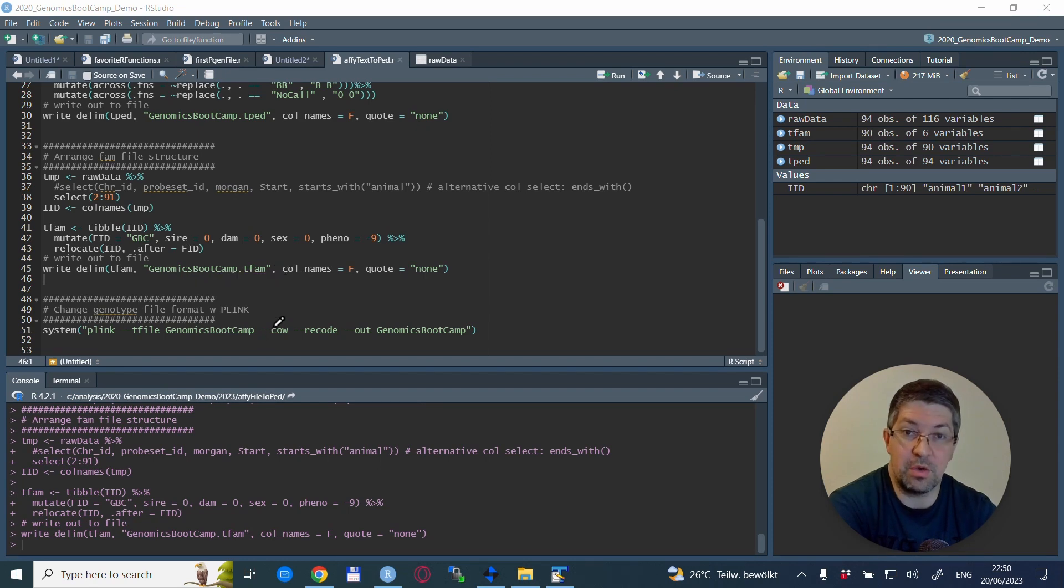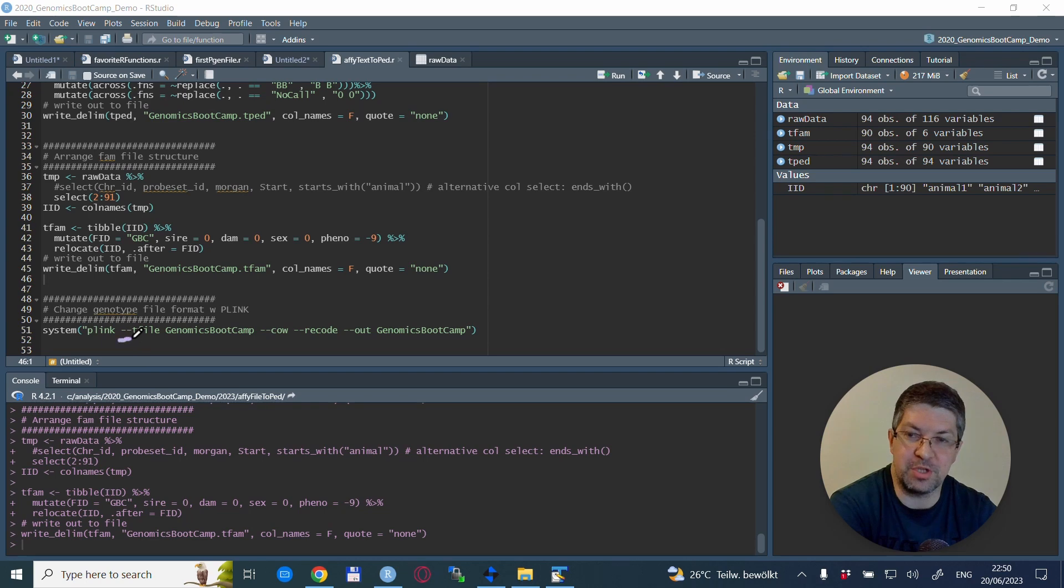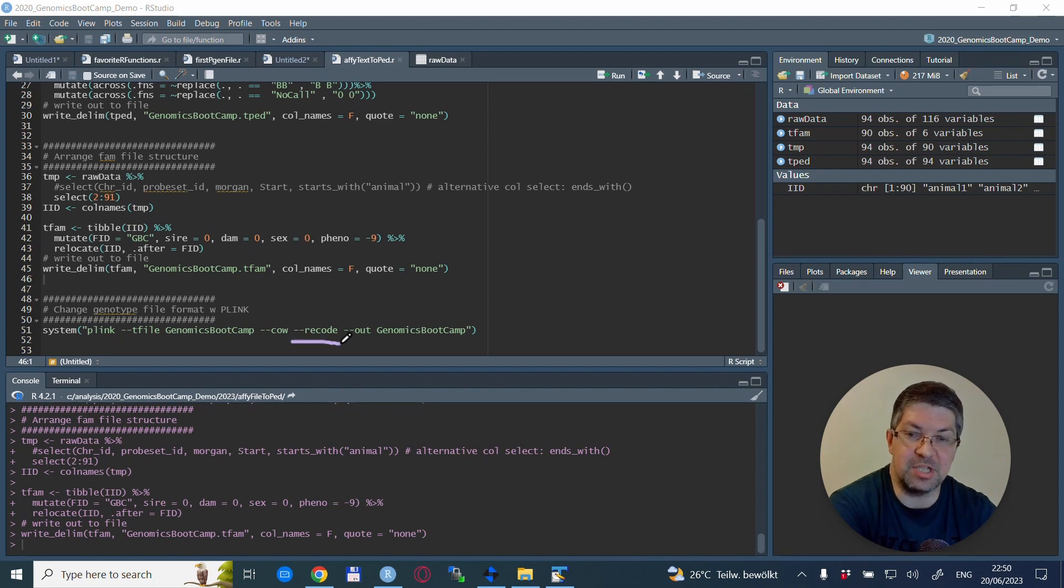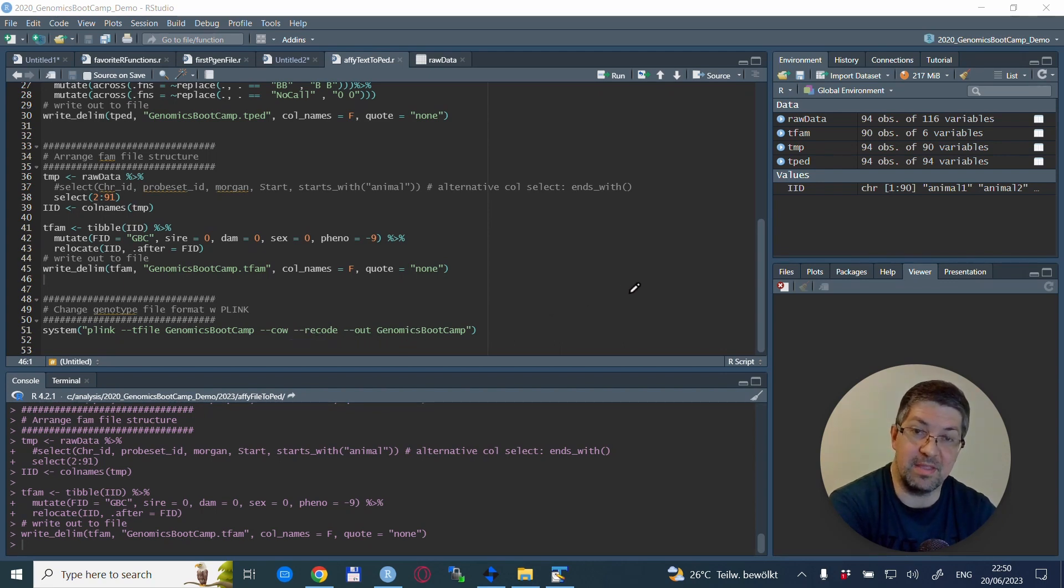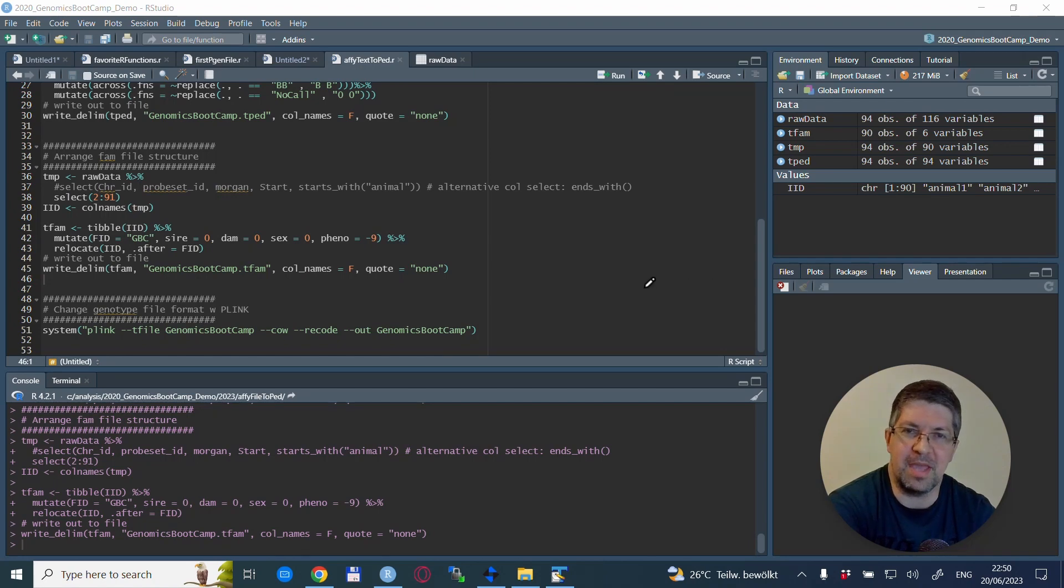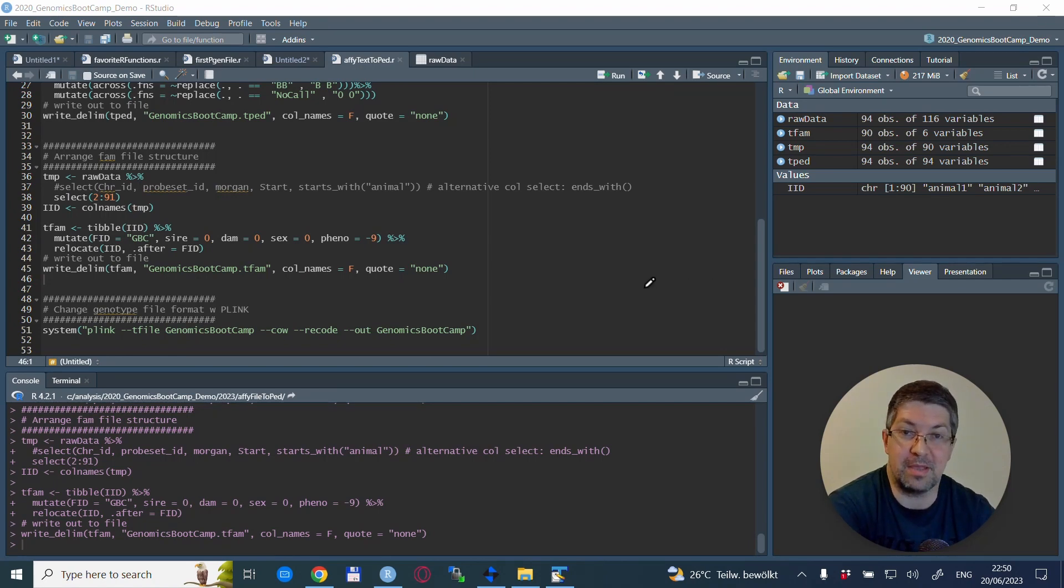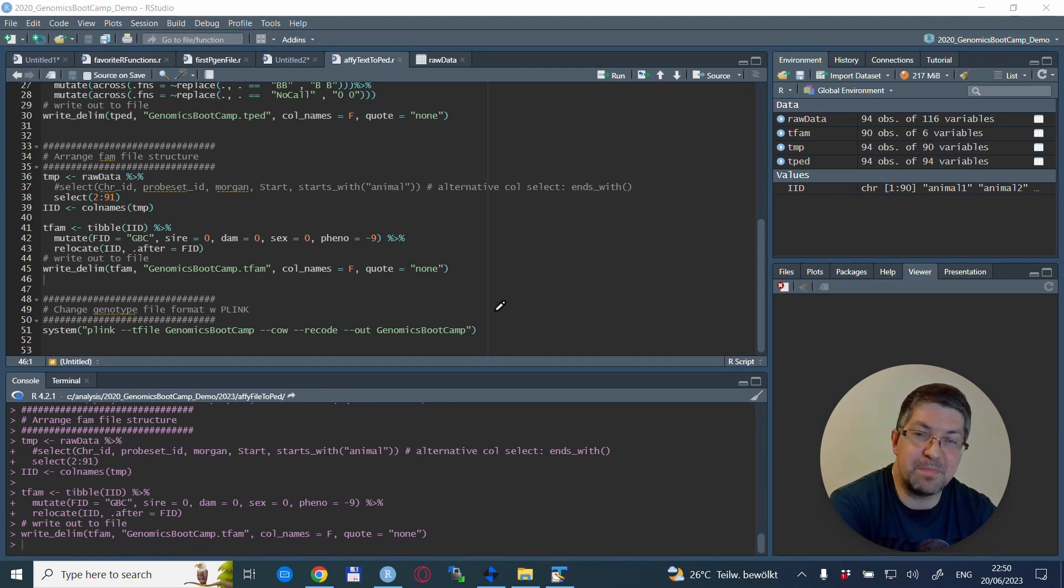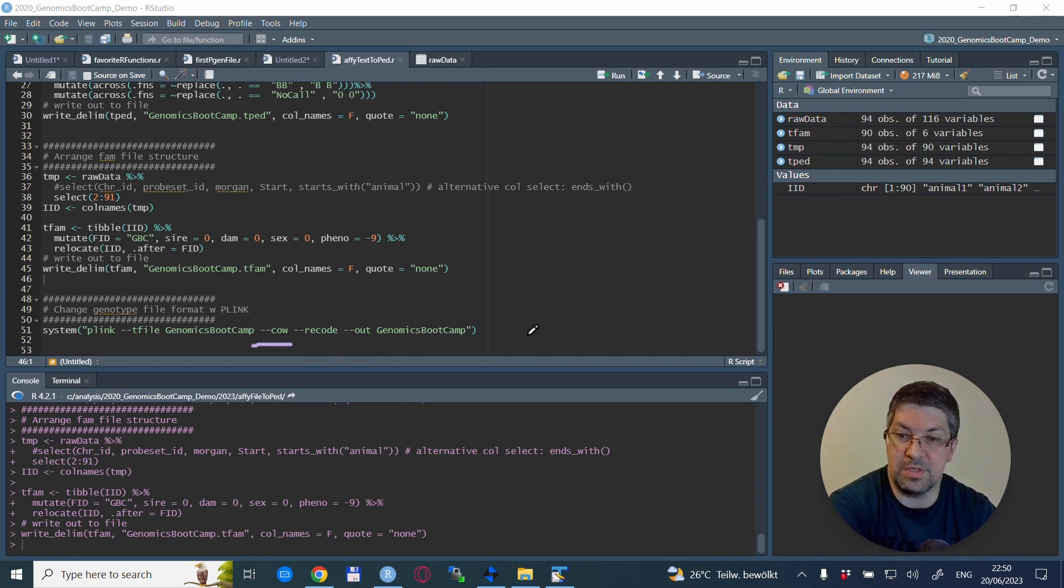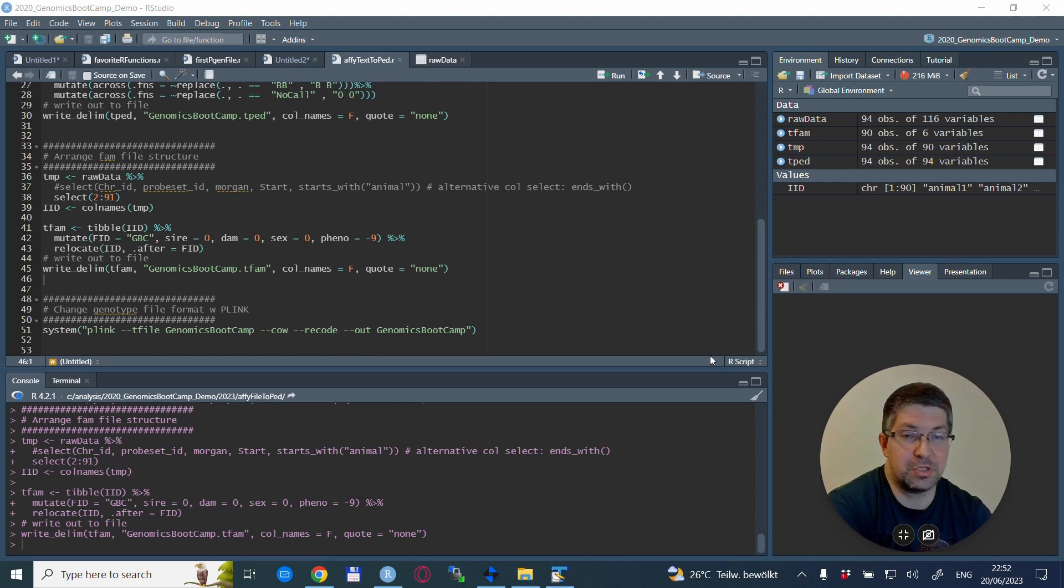And when we have this, we just write it out again with the write_delim statement. Once this is done, we have already the tped file on our hard disk. So what we can do is use the plink option --tfile, reading these ones in, and using, for example, the --recode option to create ped and map files. Of course, if you want binary ped files, you can use --make-bed, or any other plink possibility that you want. In this particular case, because we have cattle data, we also use the --cow option.